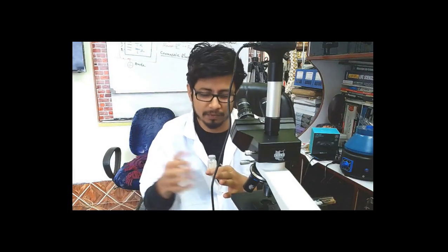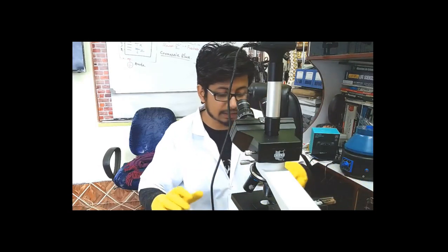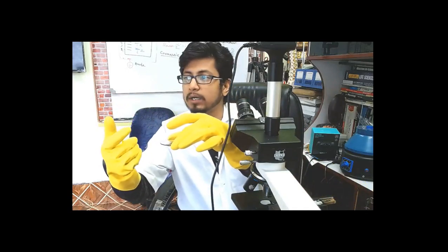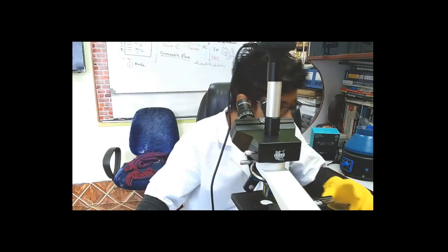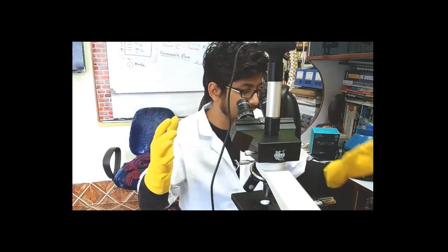We are now heating the root in the acid — you can see the smoke coming. It's almost done. We are going to replace the acid with some distilled water to wash it.